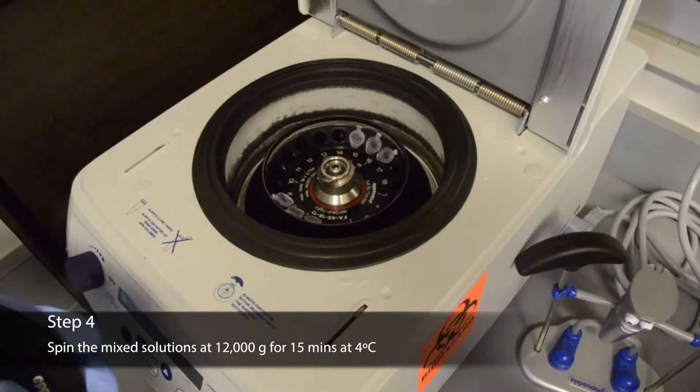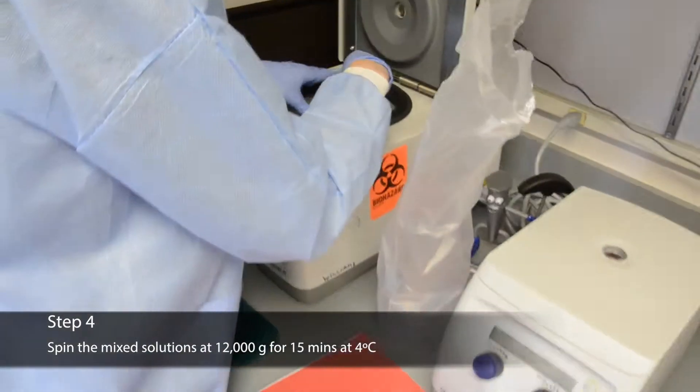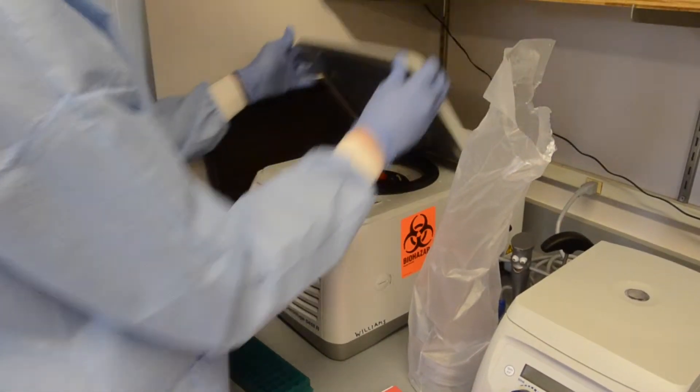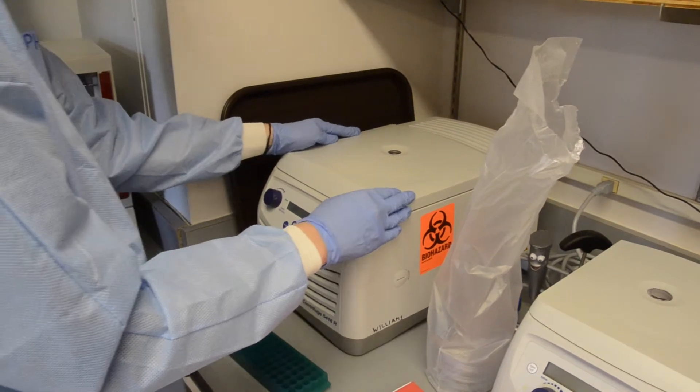Spin the mixed solutions at 12,000 g for 15 minutes at 4 degrees Celsius. During the centrifugation, it could be helpful to label the rest of your tubes and columns as well as get ice.